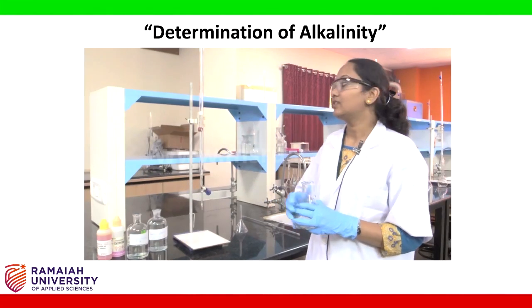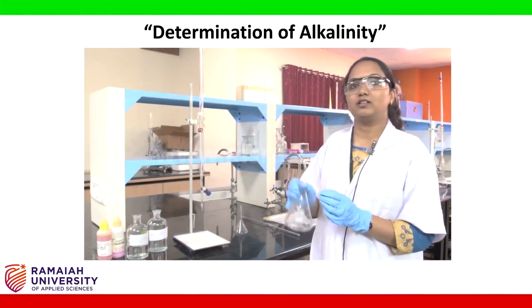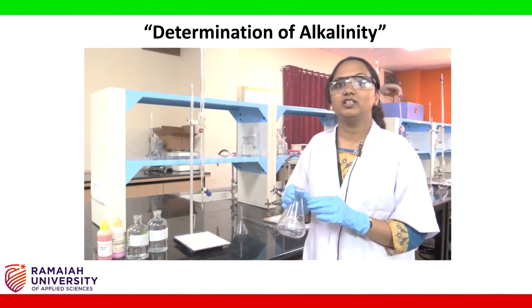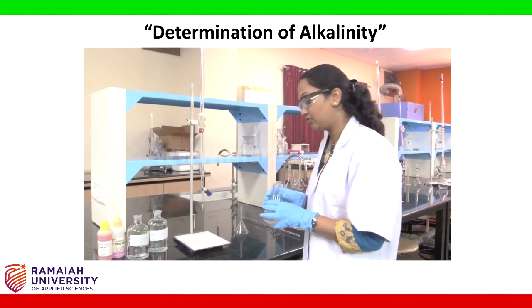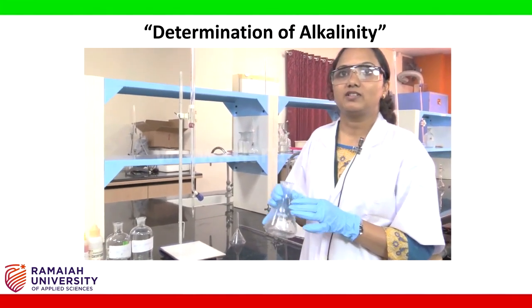So after filling the burette with the sulfuric acid, now we have to take the water sample in the conical flask, that is around 10 ml of the sample. So before taking the sample of 10 ml, we are going to rinse with the water sample.